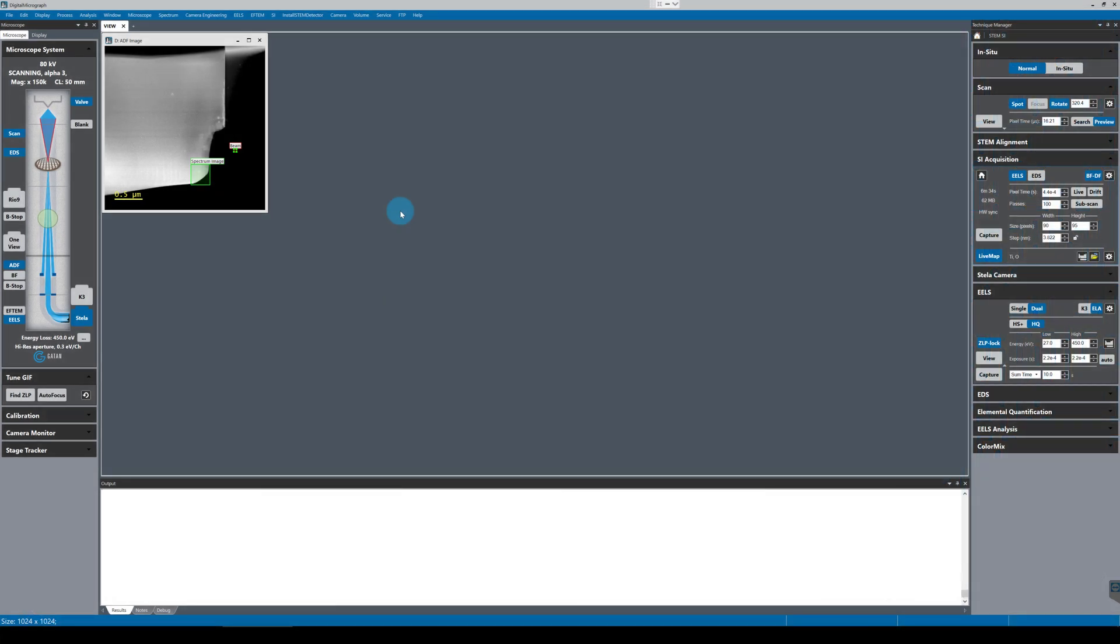We are going to be looking at how to use the GIF Continuum K3 with Stellar to acquire EELS spectrum imaging data using the Stellar camera.